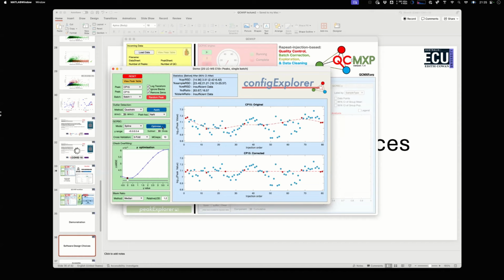that search area. What I generally do is I constrain the lower limit to 0. So the worst it can do is that kind of smoothing. It can't do a point to point even if it wants to. So again, use it in the way that you like.